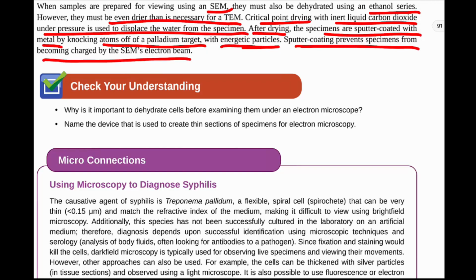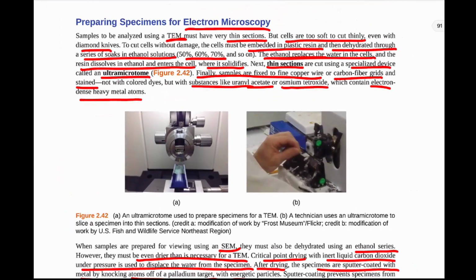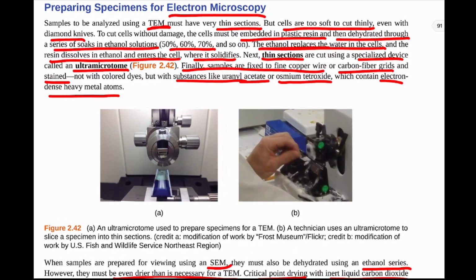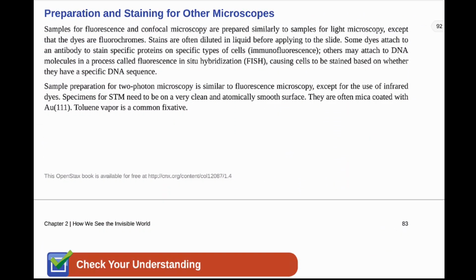All right, so just remember those specific things. So just kind of this preparation process, something we won't do in the class. We don't have electron microscopes, of course, but the TEM and then the SEM. All right, so then preparation and staining for other microscopes. Remember, we had those probe microscopes that we talked about and 2-photon microscopes. So here's some other staining methods here.